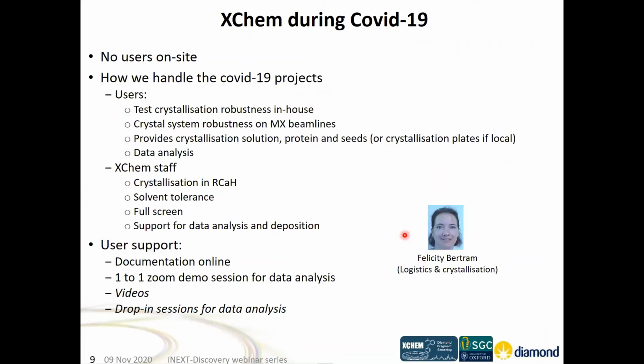Basically, Felicity moved a bit from the MX support group to help us in that sense on the logistics and the crystallization. Again, you would heavily rely on documentation online, but we also organize Zoom sessions for you, especially if you've never done anything with XChem. We are now starting to record all those videos so that you can go back to those training materials.